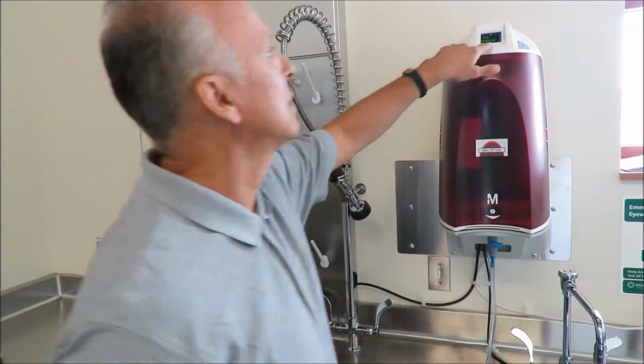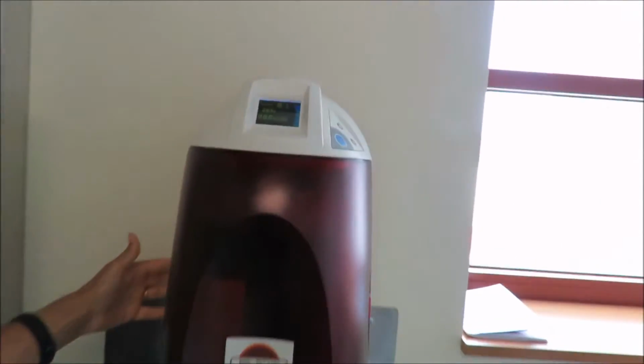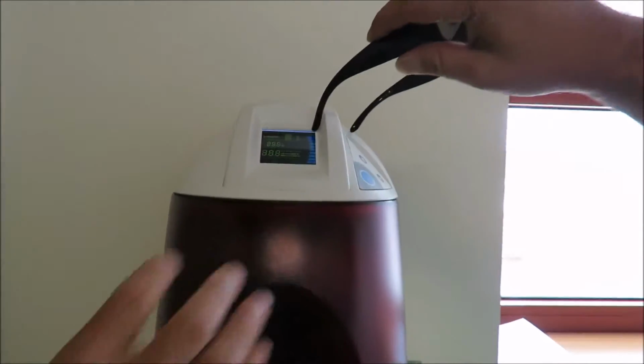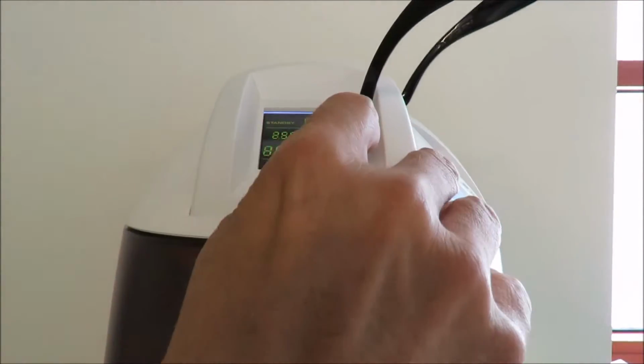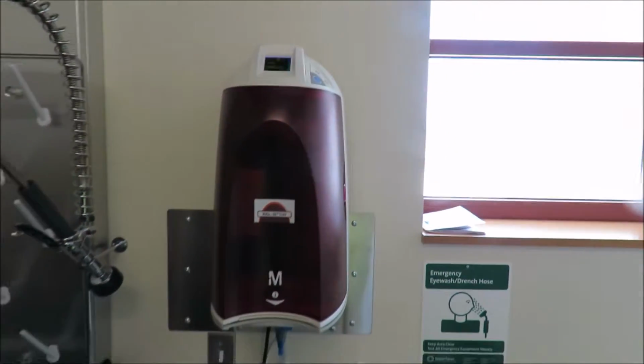When it stops, you know, this is actually a fill gauge telling you where the tank is. It has a 6-liter reservoir built into it. Is that the fill gauge right there? Yeah, this is the fill gauge. Okay, so you got 2 notches left. It's got to fill. Exactly. So as soon as it gets to the top, you should see this stop.